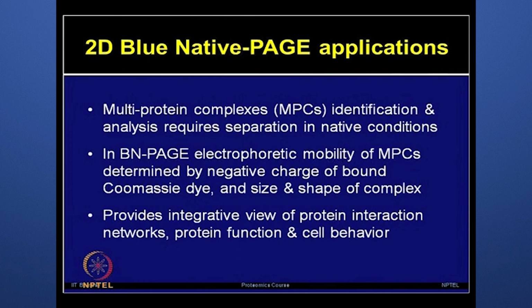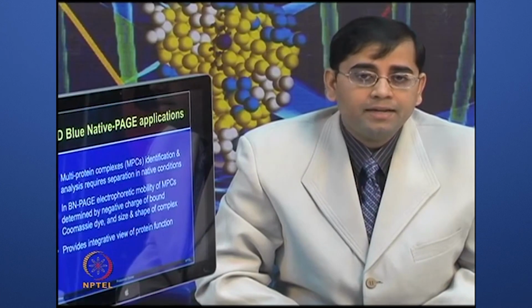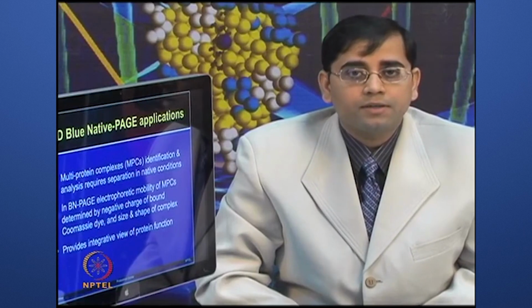So, MPCs can be identified by using the blue native page. In blue native page, the electrophoretic mobility of MPCs is determined by the negative charge of bound Coomassie dye and the size and the shape of complexes. So, this technique can provide the integrated view of protein function.